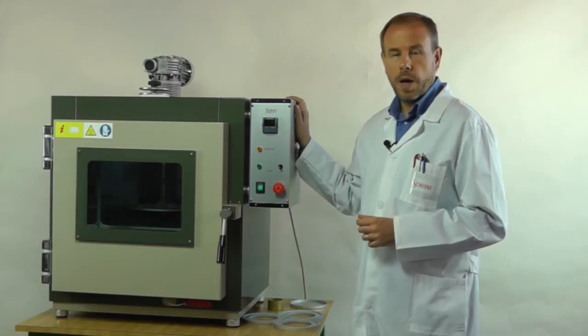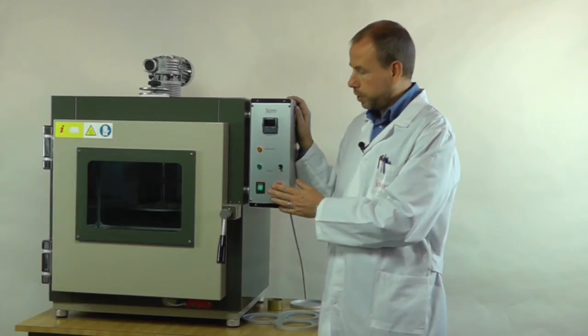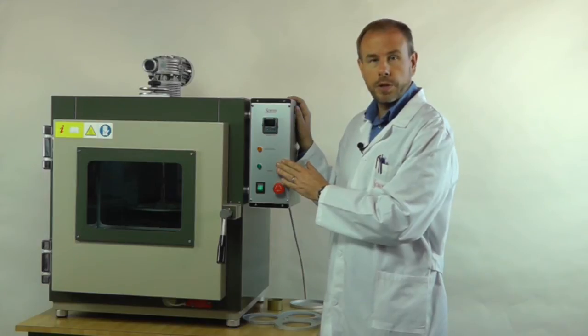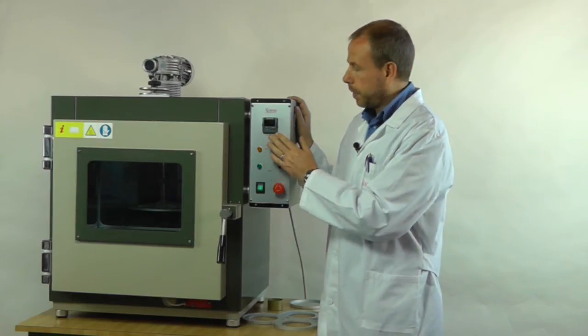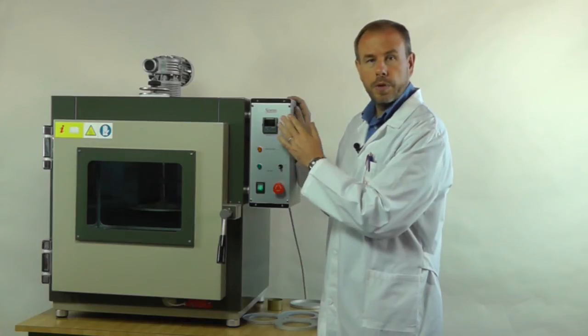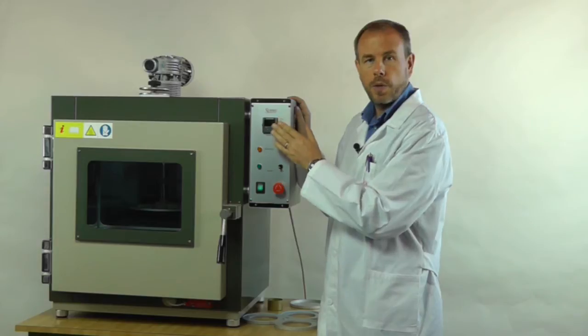On this side we have the control box with the main switch, the emergency switch, a dedicated switch for the shelf rotation, the alarm lamp and the thermoregulator with double display, one for the current temperature and the other one for the set point.